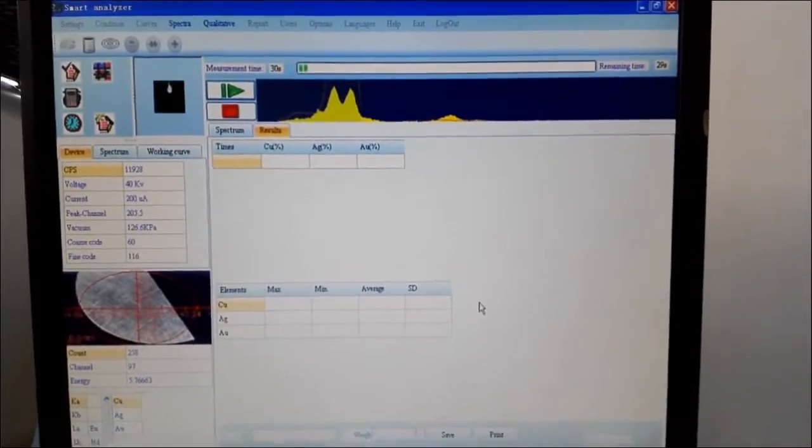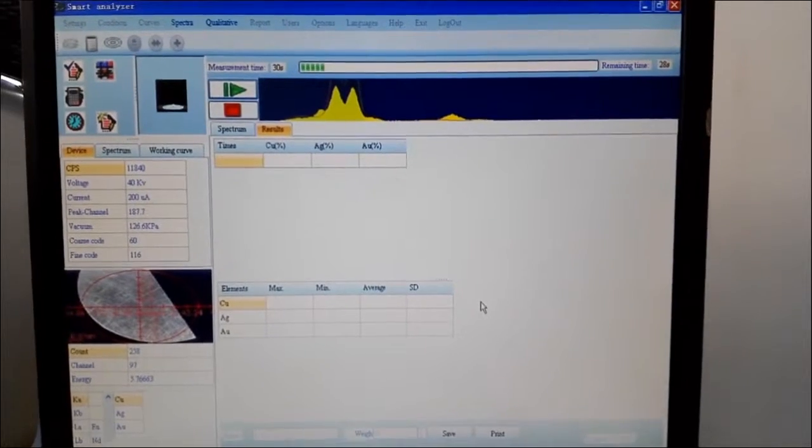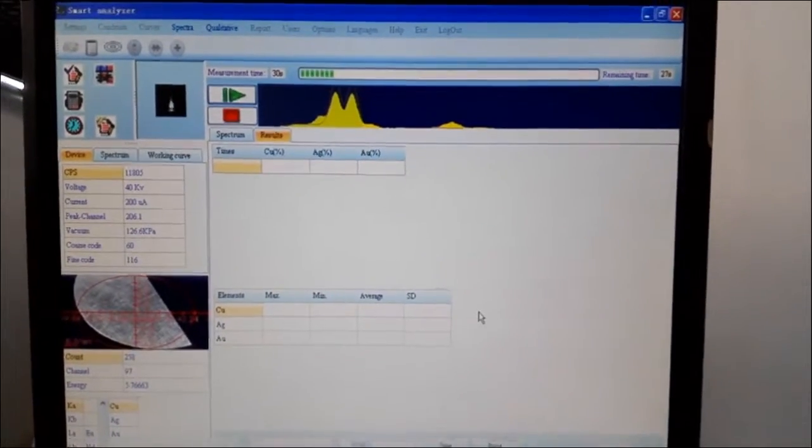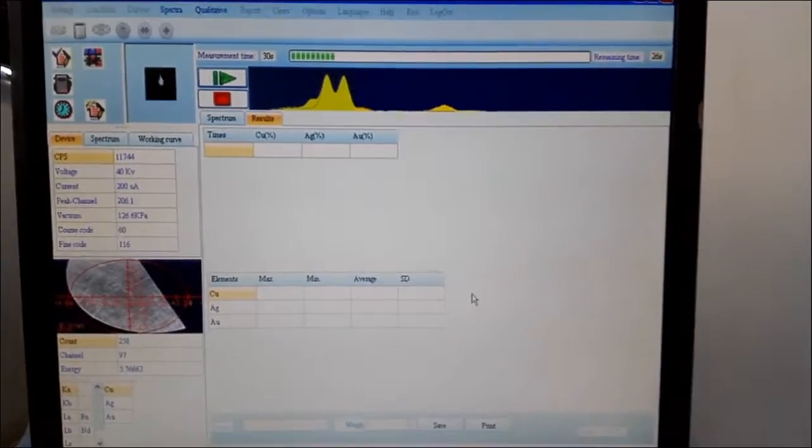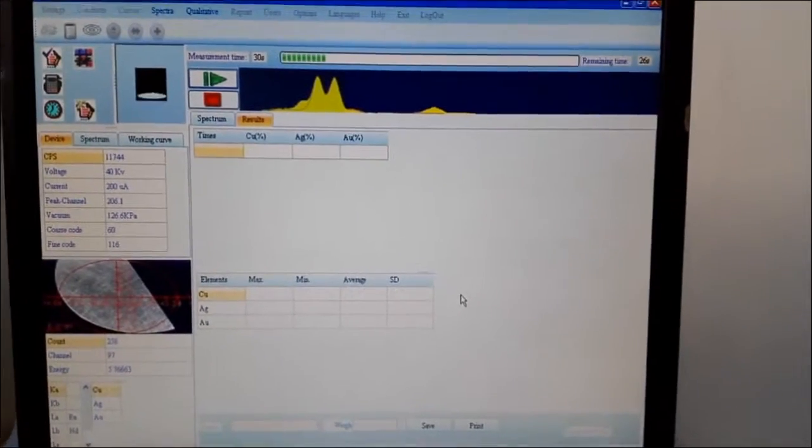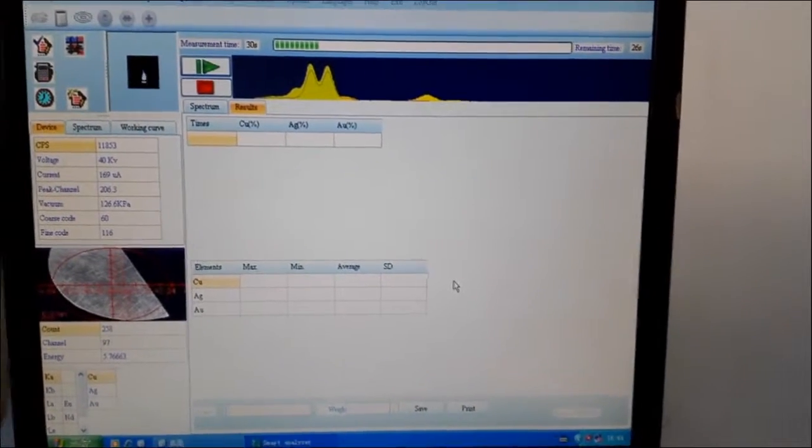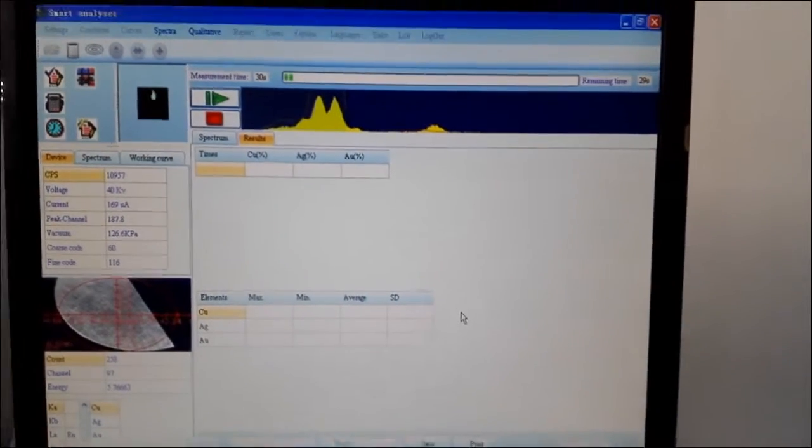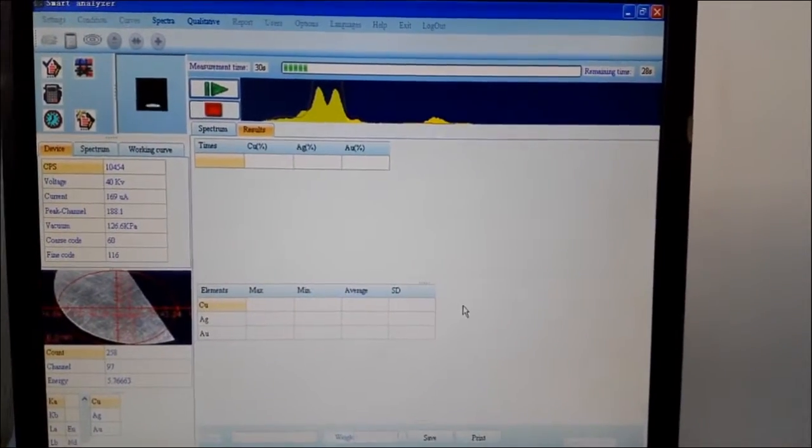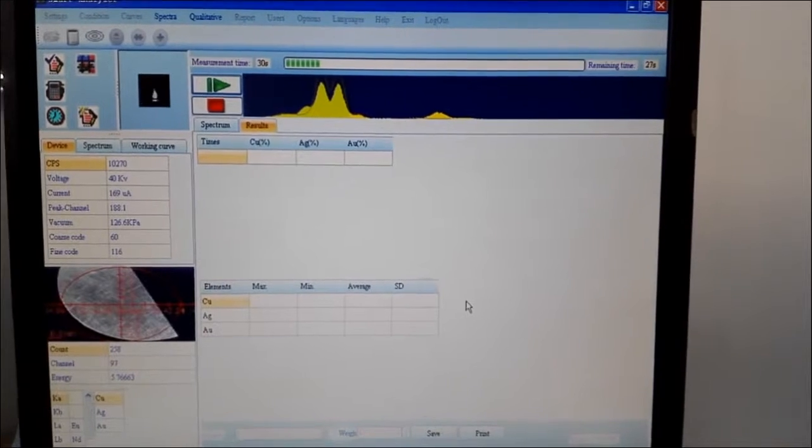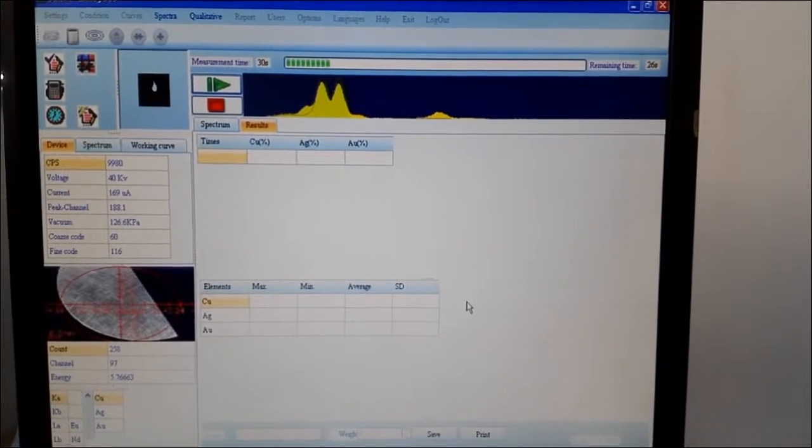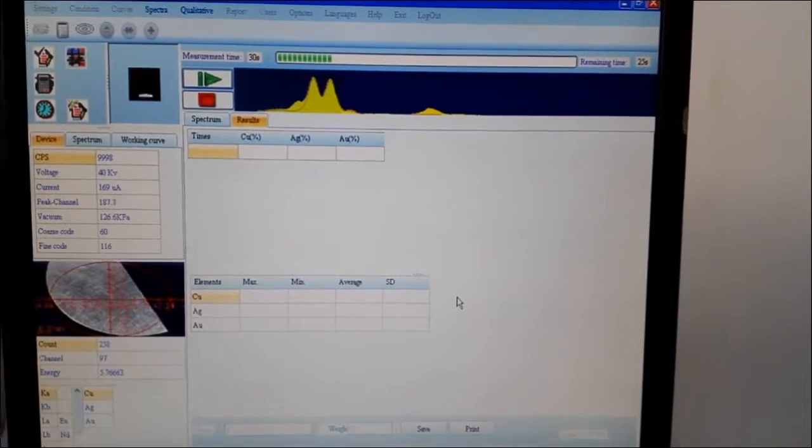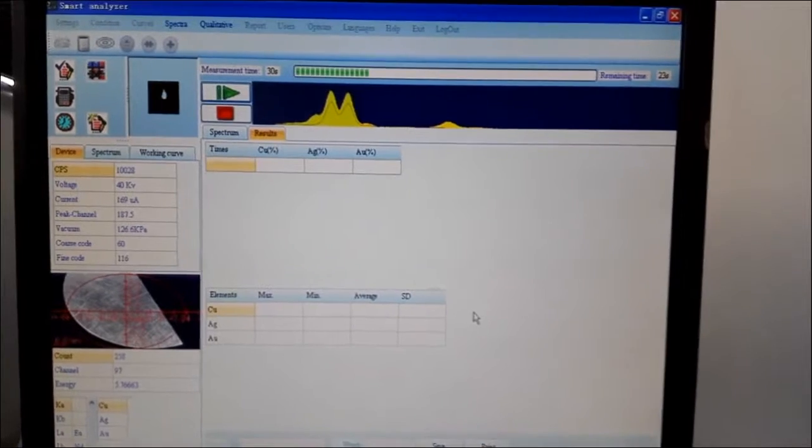With EDX-600, you will get a very reliable result within 30 seconds. It's now testing. The sample we loaded is an 18 karat gold standard.